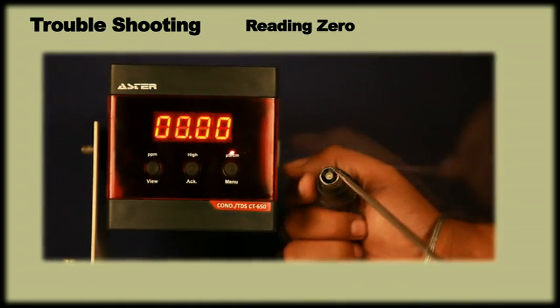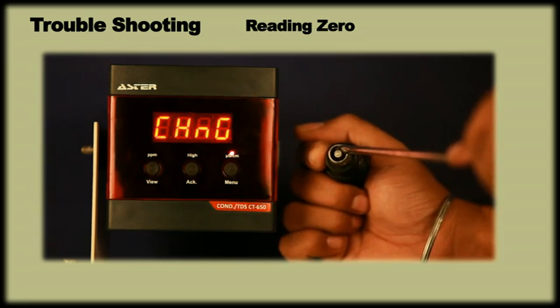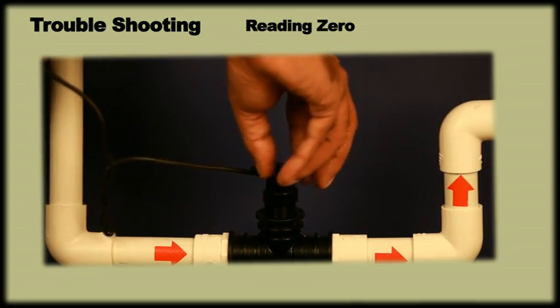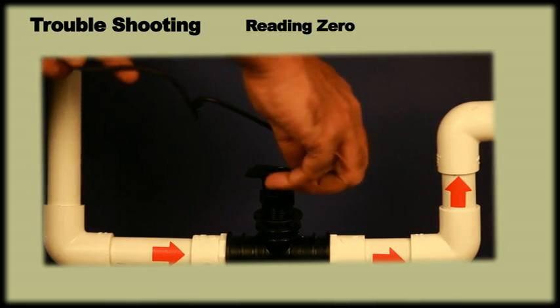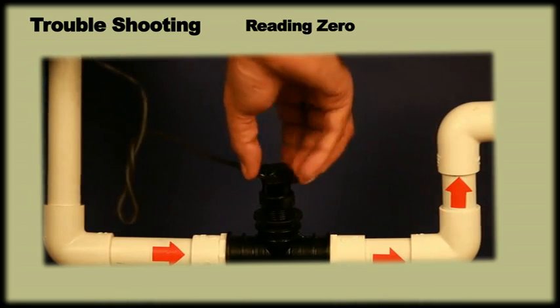If conductivity remains zero, remove the sensor from line and short the electrodes. On shorting the electrodes, the display should show over range. If it shows over range, reinstall the sensor ensuring the electrodes are in proper contact with water. If it does not show over range, then the sensor cable might be open. Contact service center.